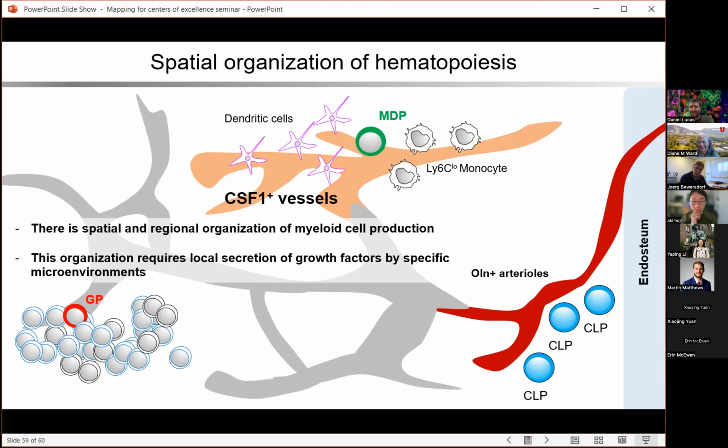Okay, so is there a need for more colors? Always. More colors allow you to ask more questions. Have we considered using the CODEX system or similar? We've tried very, very hard to get that to work. I think there are two major limitations to the system. One is the multiple cycles of cleaning the bone marrow, because the cells are so loose in the marrow, they detach after you do three to four cycles.